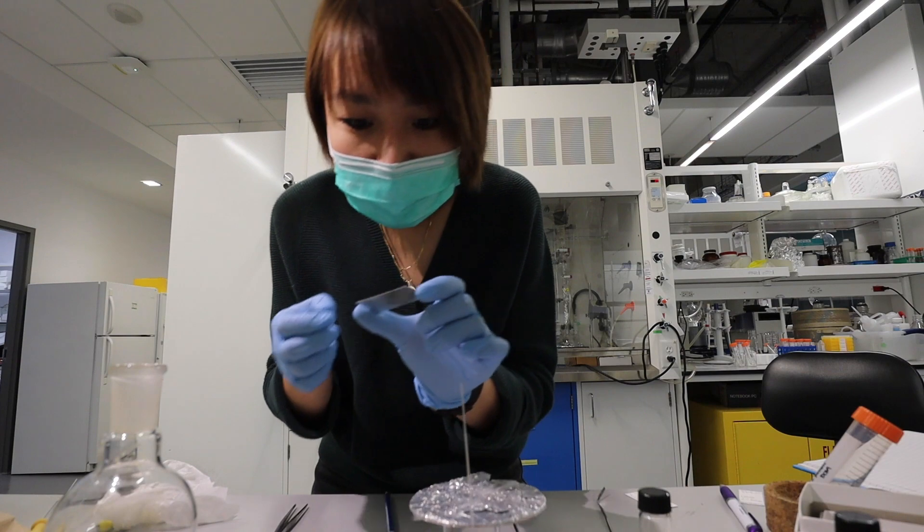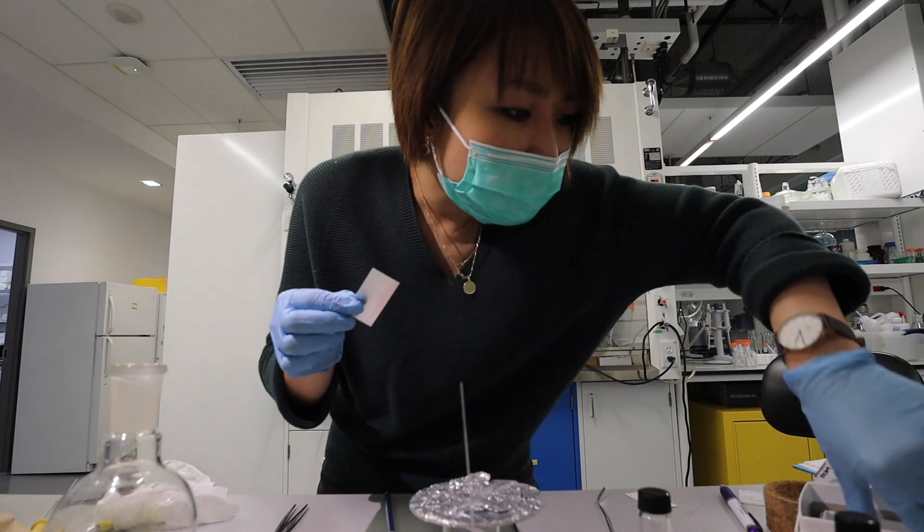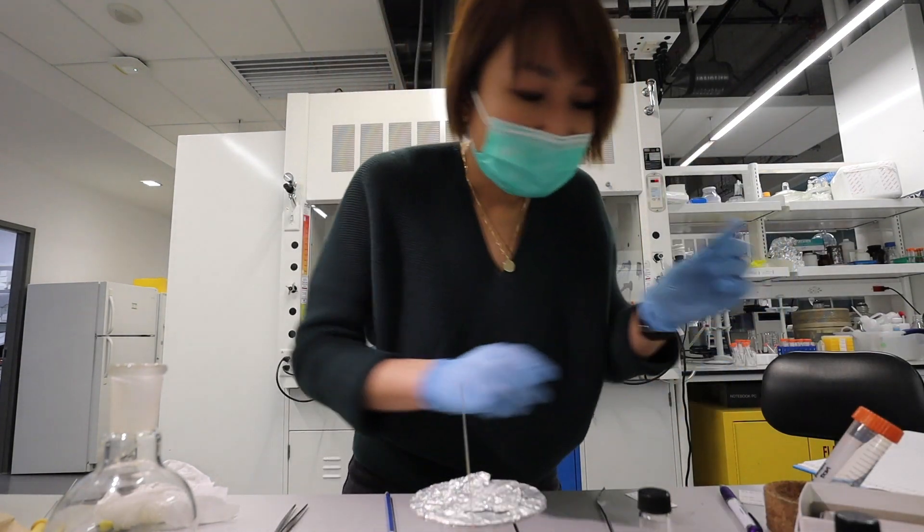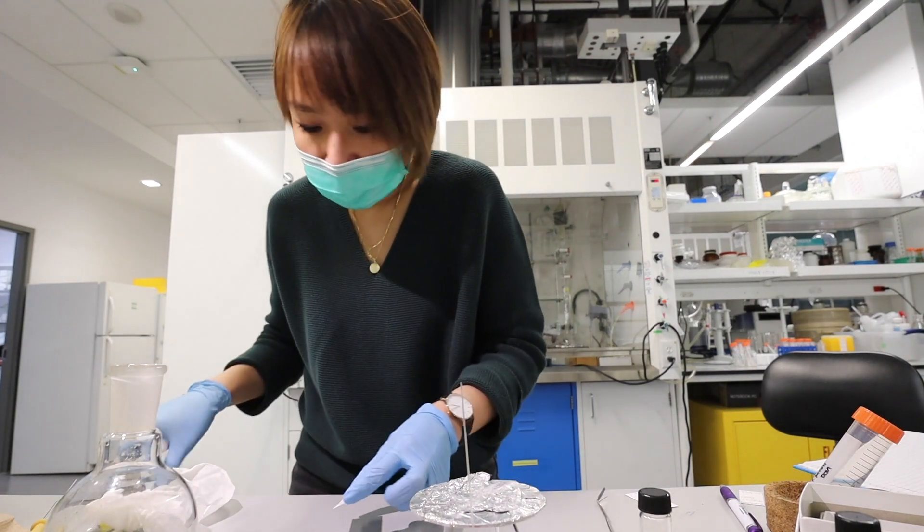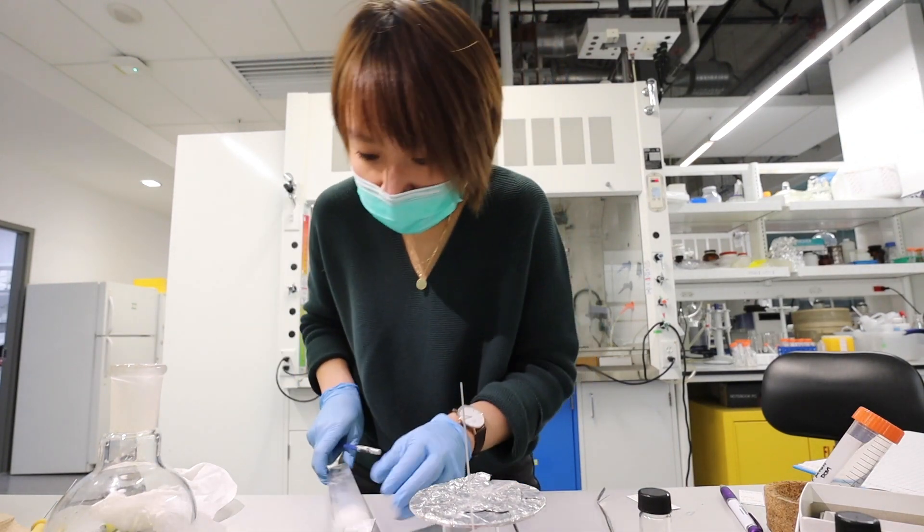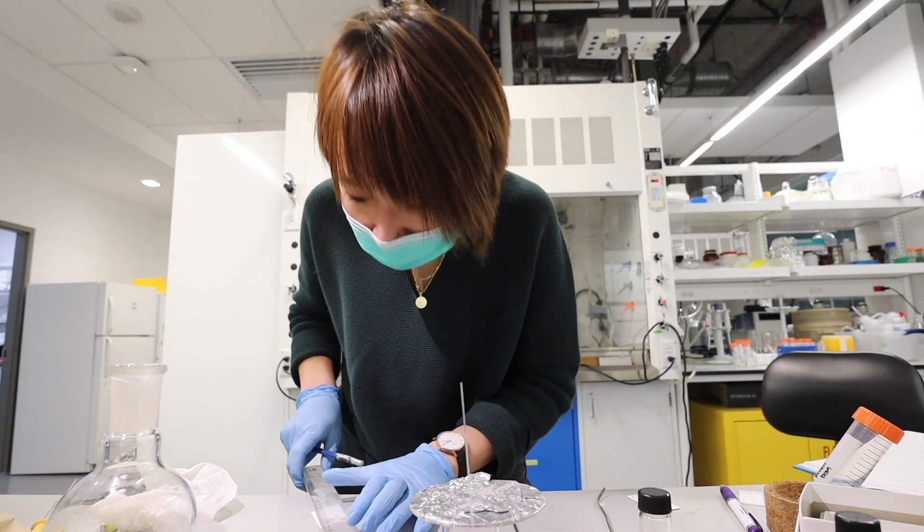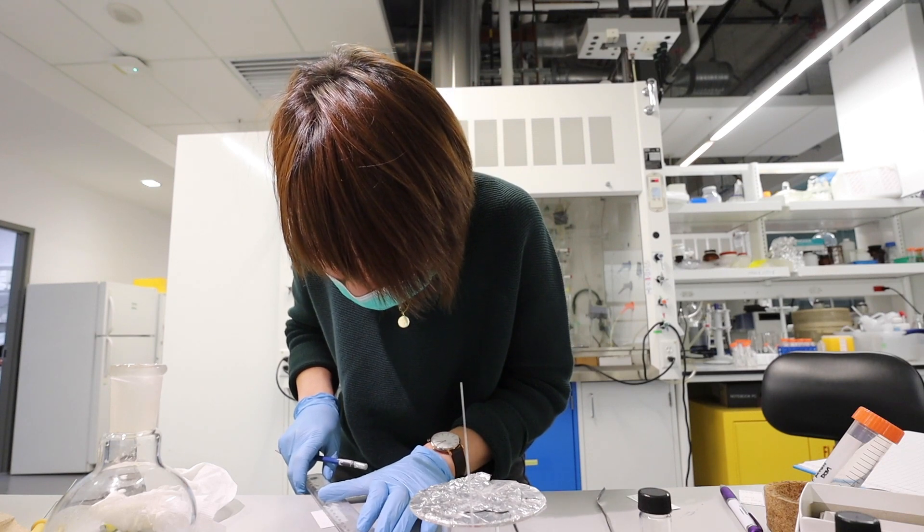I should also do one more TLC just to confirm that I collected the right compound. I think I did because the other ones did, but let's just do it one more time with the final compound.